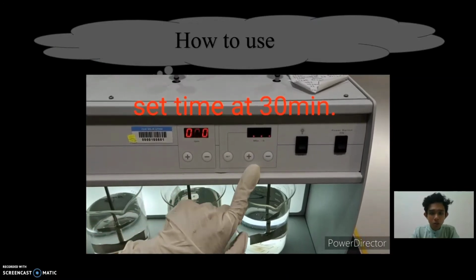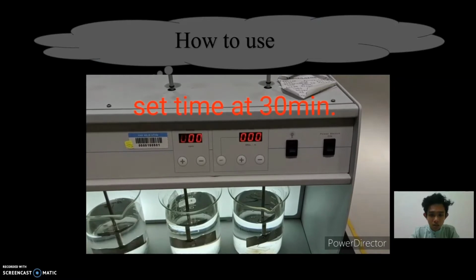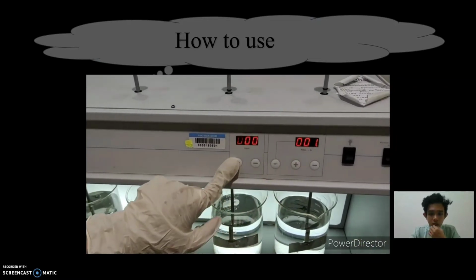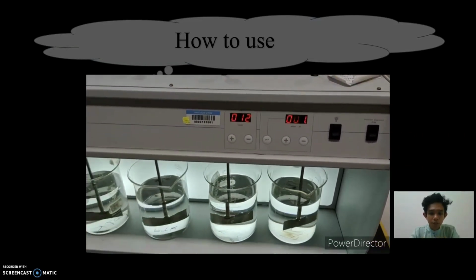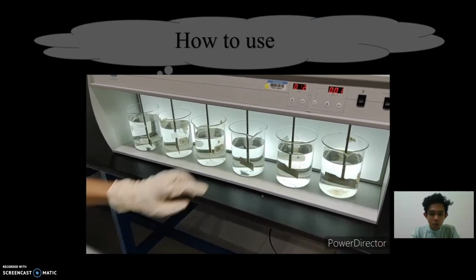And we have to set the time at 30 minutes. Then set the speed at 60 or 80 RPM. We can see that the stirrer moves.